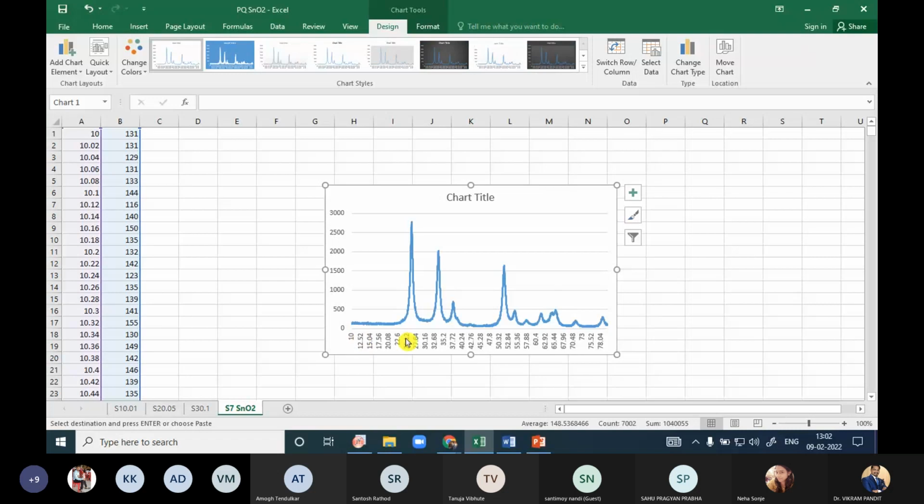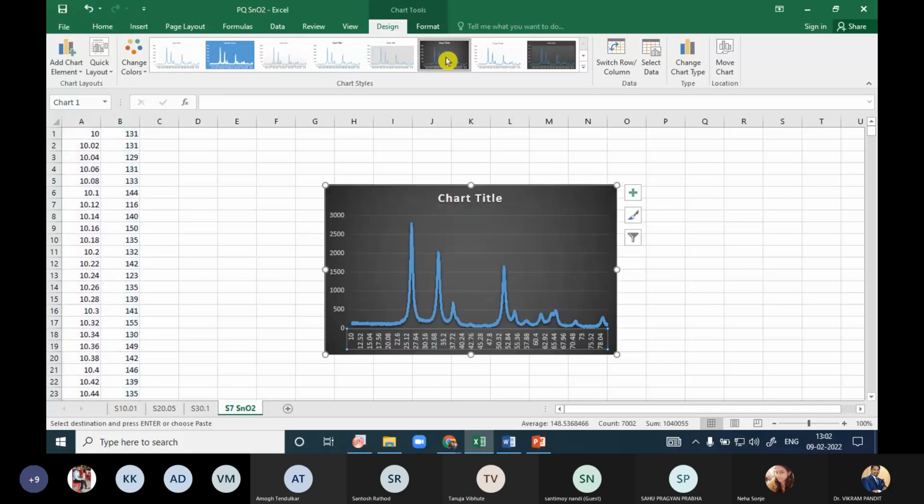Now again, a similar process you have to follow. Just click here. You can change it to anything, whatever you want, you can click it here. But you cannot get good quality of spectrum, and you cannot make a box within a short period of time. Yes, there are a lot of things to learn from this Excel. If you know all those tricks, then your time will be saved. Okay, very beautiful. See, such types of graphs you are getting from Excel.